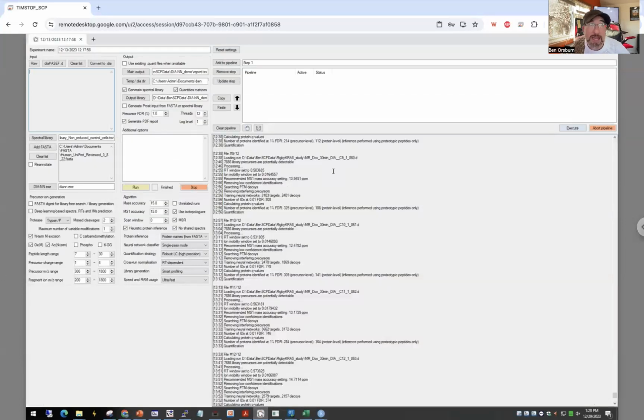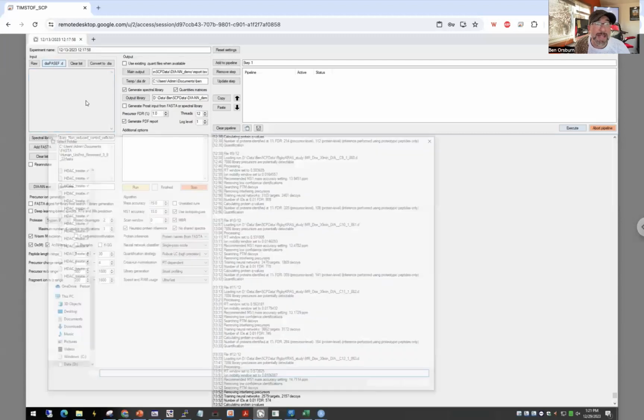Chances are you've probably used DIANN more than I have, but these are the things to go over here if you're not really familiar with this and are using it in this context. First of all, we just want to pull up a diaPASEF study.